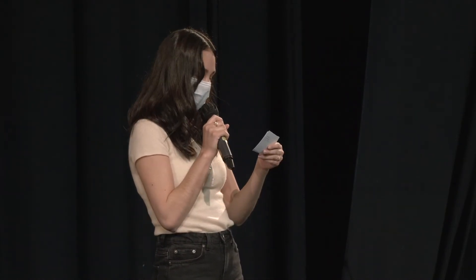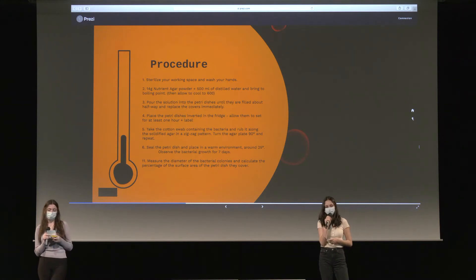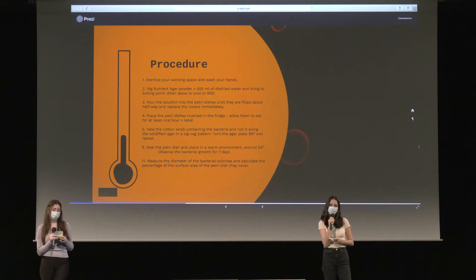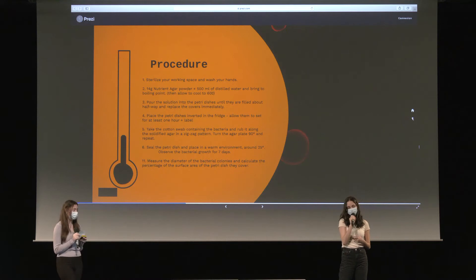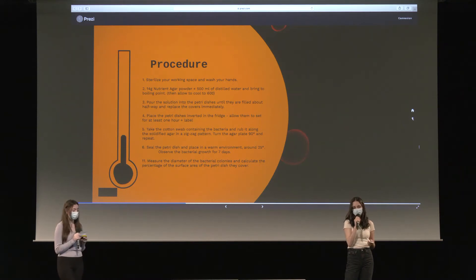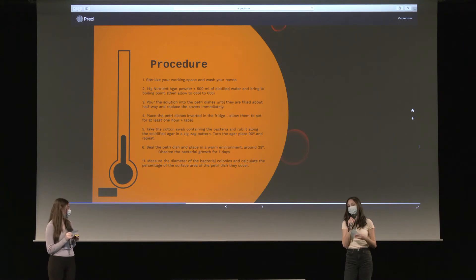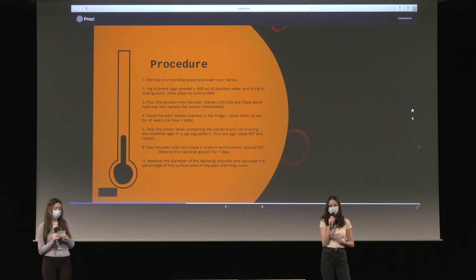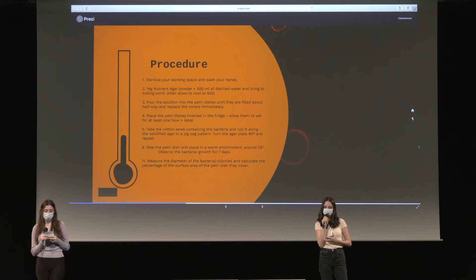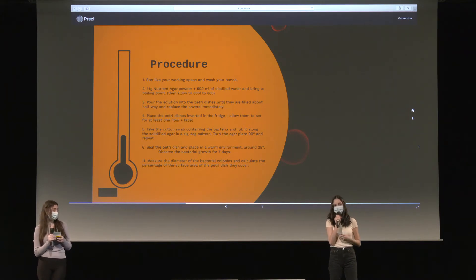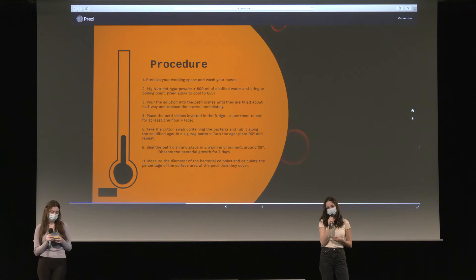To allow them to set, we placed them inverted in the fridge to avoid condensation forming on the agar plates. We then collected our bacteria samples in three different locations, which were shopping centers, and we made sure to test the same surfaces in each location to receive the most accurate results possible. We then swabbed the bacteria onto our agar plates and left them in a warm environment to promote bacterial growth. After seven days, we measured the percentage of the surface area of the agar plates which the bacterial colonies had grown on.